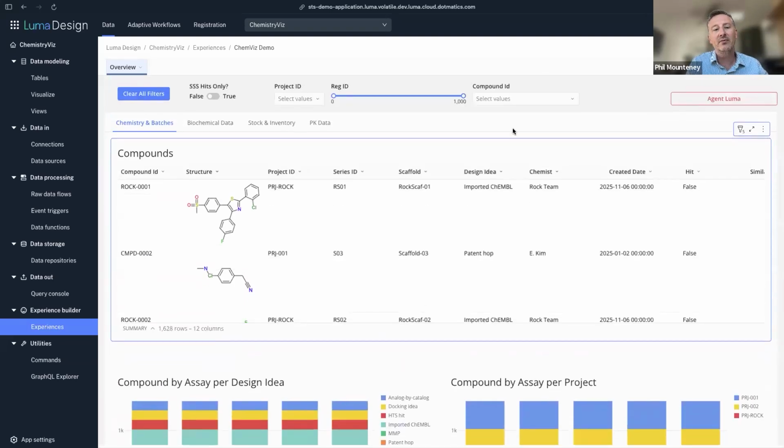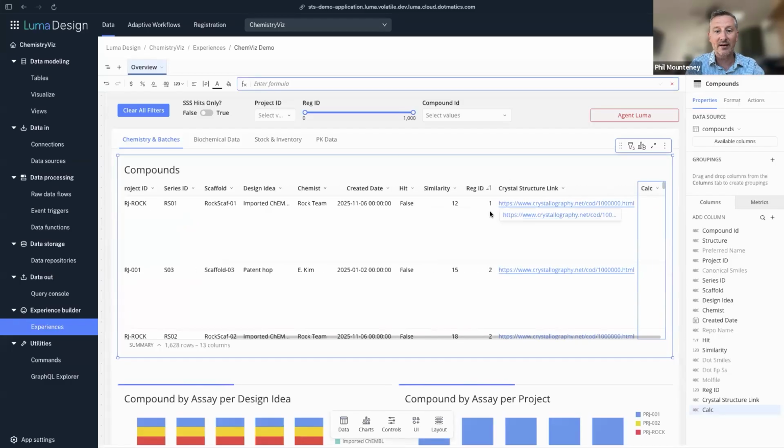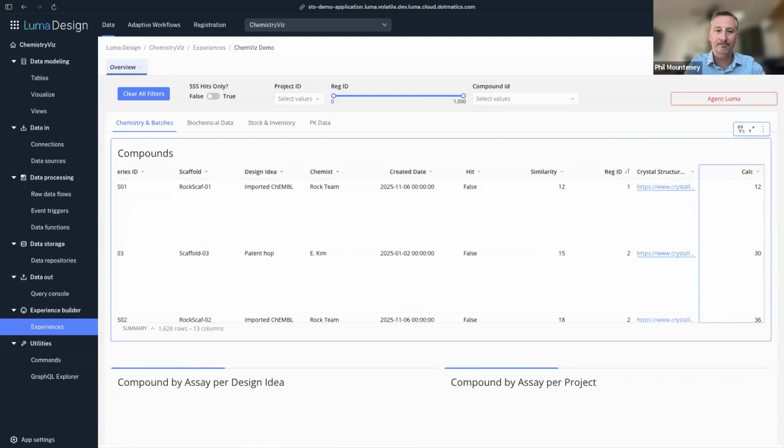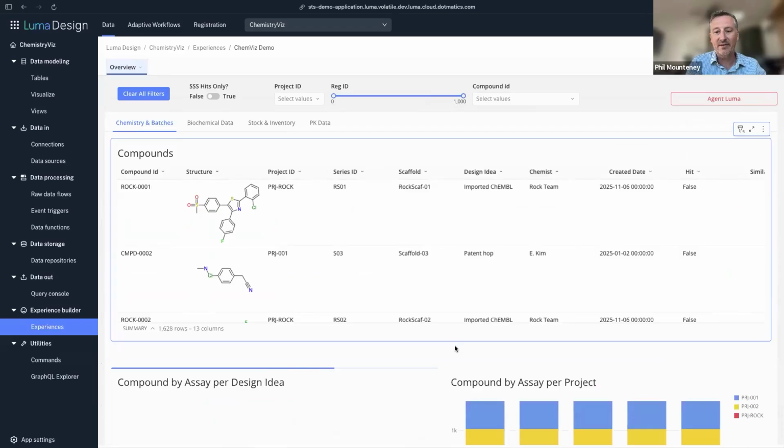One really important thing to understand about these dashboards, either in Luma or when you've shared them with your notebook, is that we can move into what we call explore mode. And this is how your users can move things around or even add calculations directly in here. So maybe I want to do a simple numerical calculation between two columns in my data set. Hit save, that's my new calculation done. I can now bookmark this as my new view for this page.